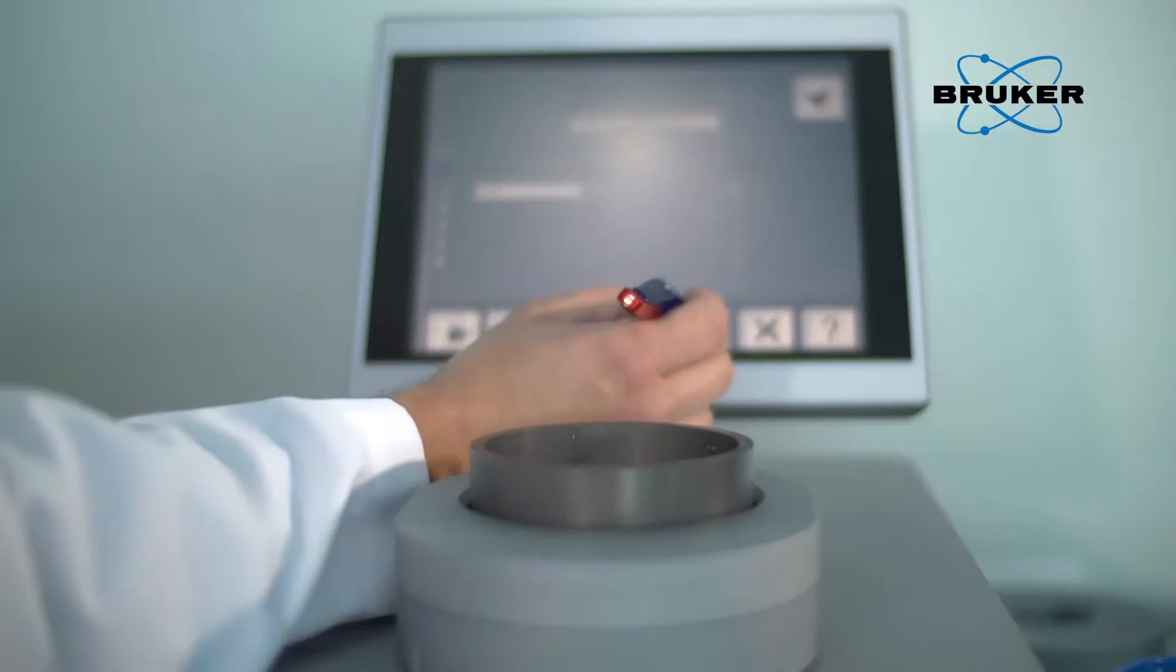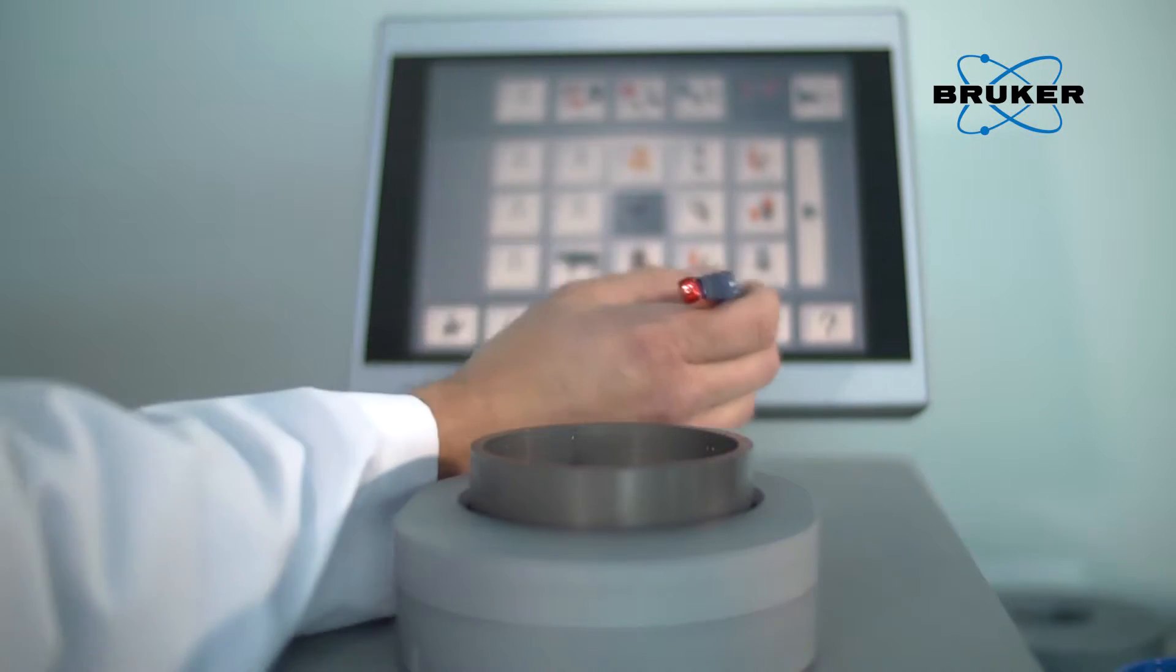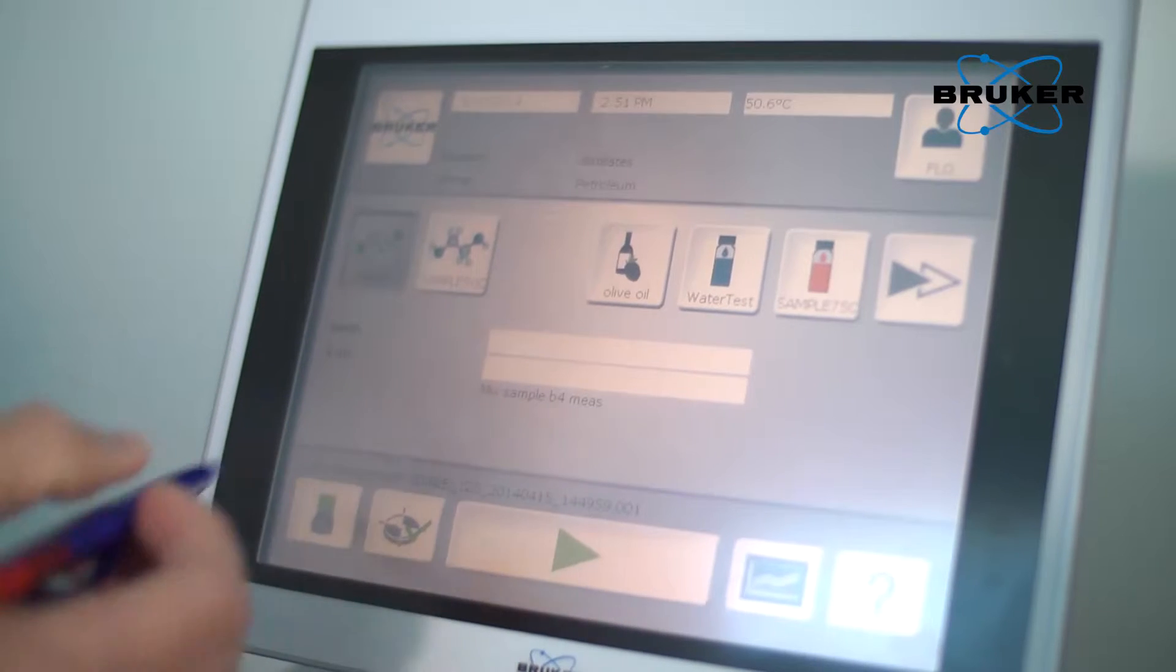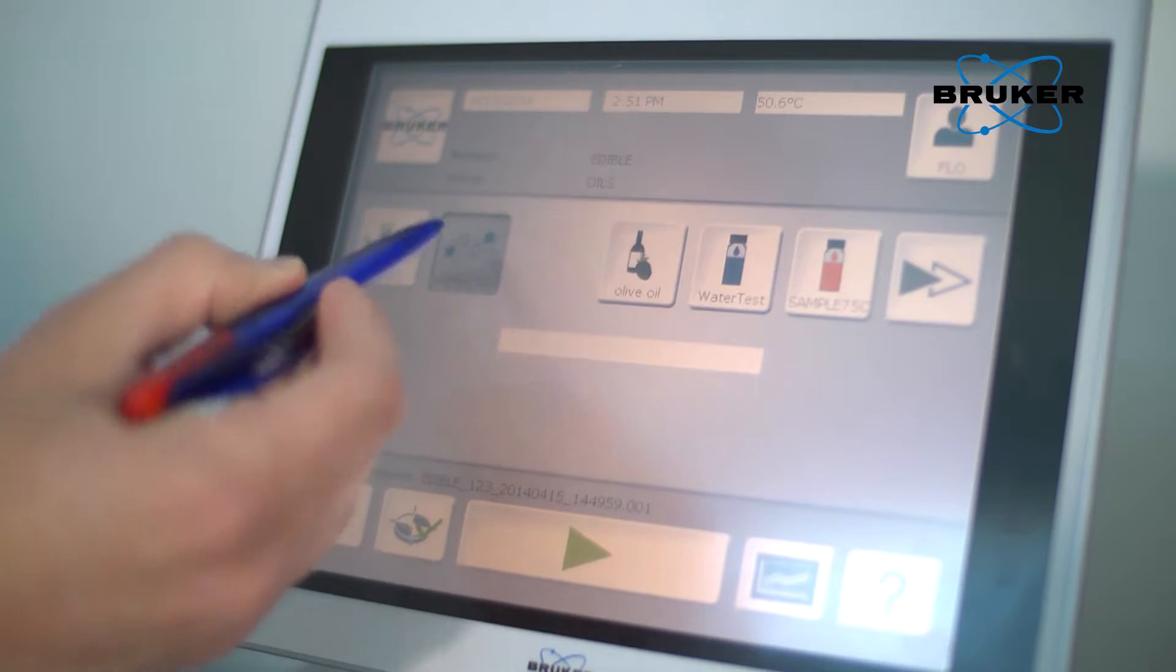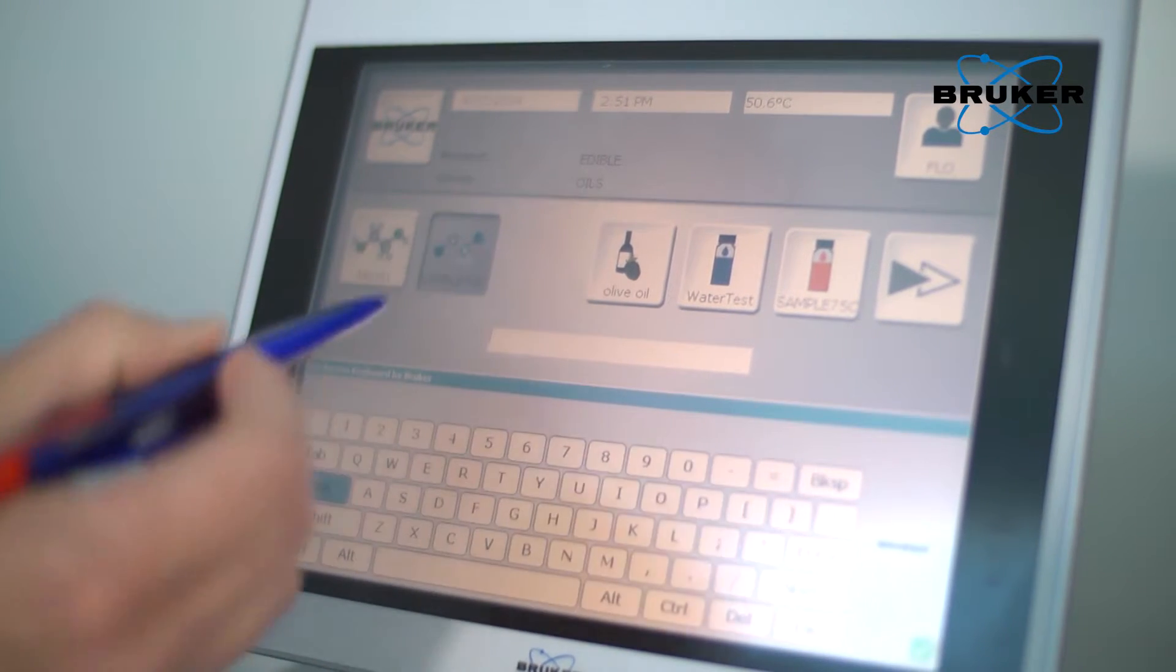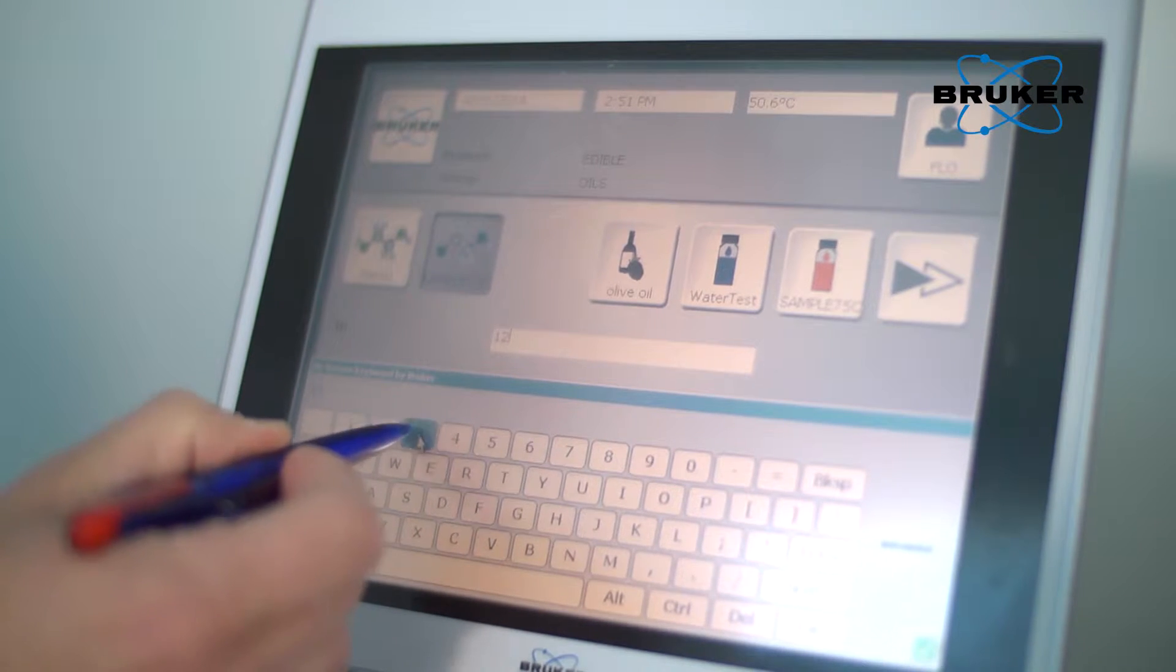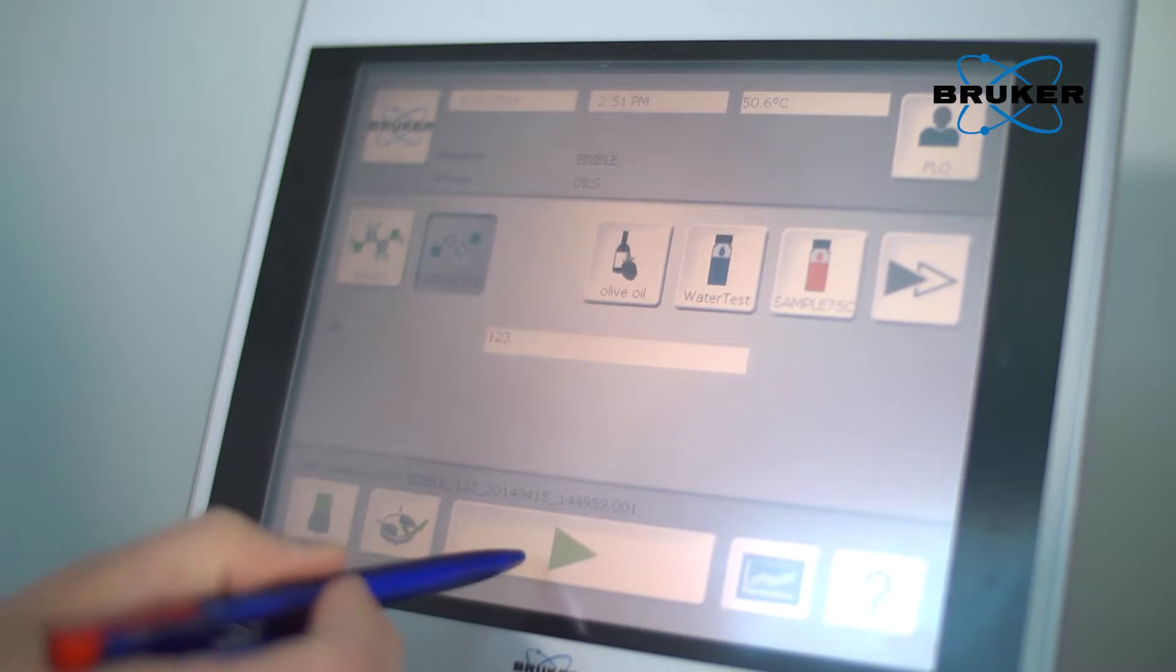The Tango software is a very powerful tool, and yet it was designed to be extremely easy-to-use software, making it ideal for quality control operations. The experience with the Tango software is similar to that of a modern tablet. Everything is icon-based, making it easy to identify the material that you want to analyze and simply touching the icon of interest and making a measurement.